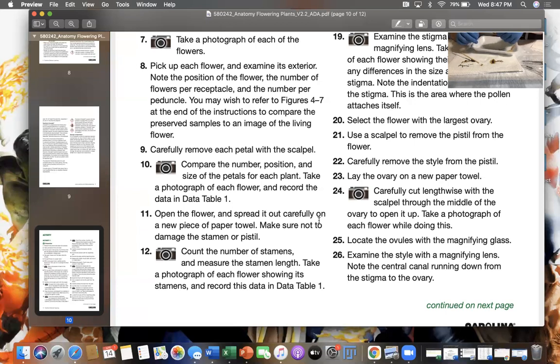So just to show the daylily, got all the petals cut off. And what you can do for the instructions, for some reason they give you metal, everything else. I'm assuming this is just like a little probe, this wooden stick. Well, at least that's what I'm using it as. We can kind of separate out everything here.